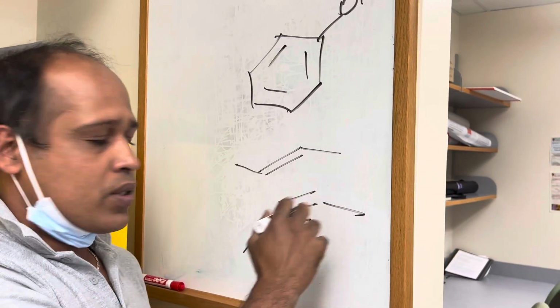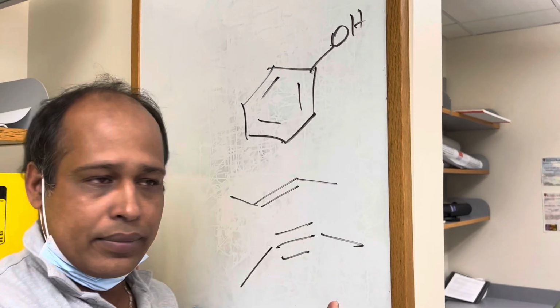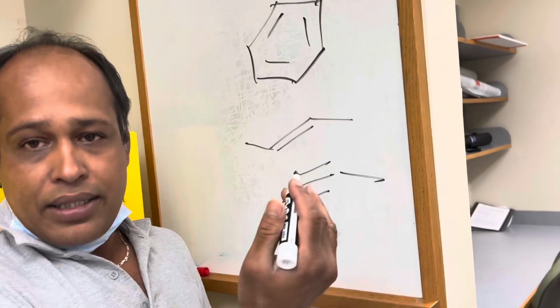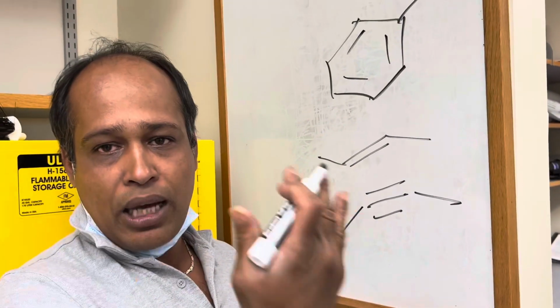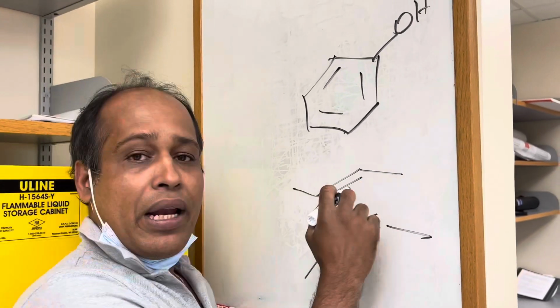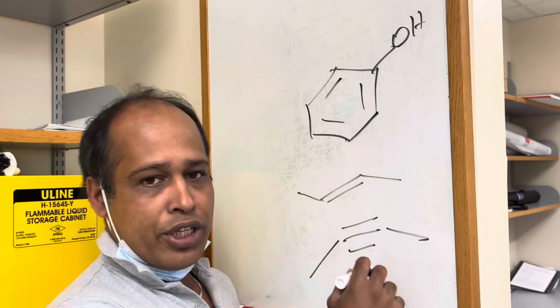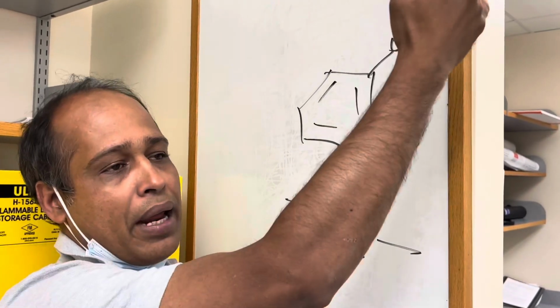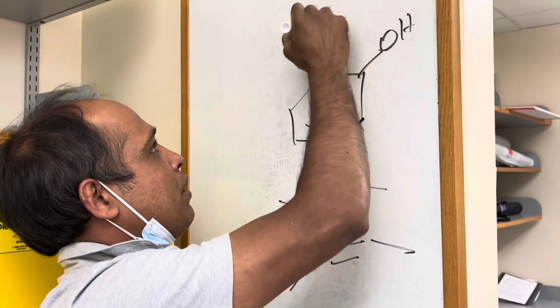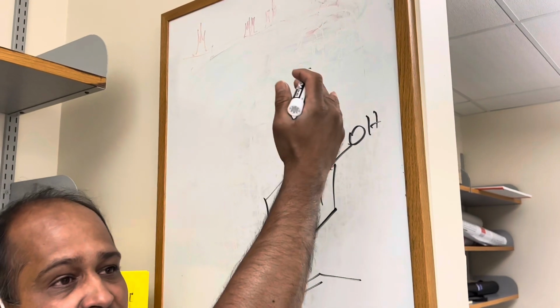So those also have a problem in the column. If you do a 2D TLC, it may give you some kind of weird idea, because they can be polymerized or do something with the double bond or triple bond, forming something weird. Or if you have an amine NH2, it will get stuck in the silica. Or NH can get stuck in the silica.